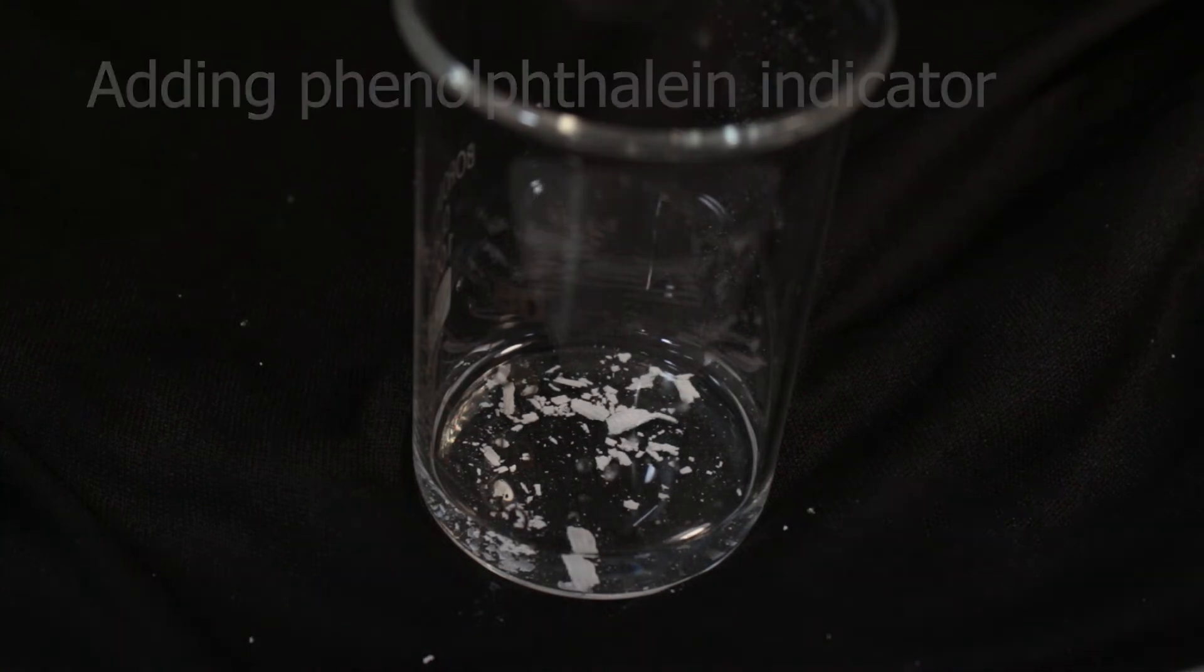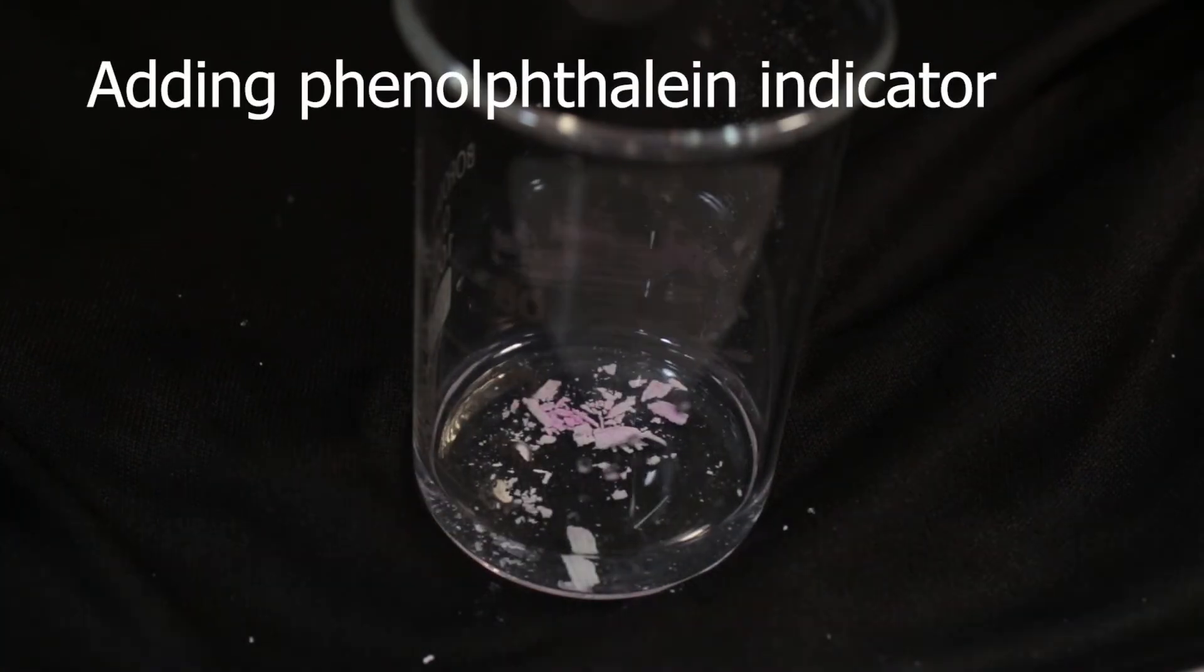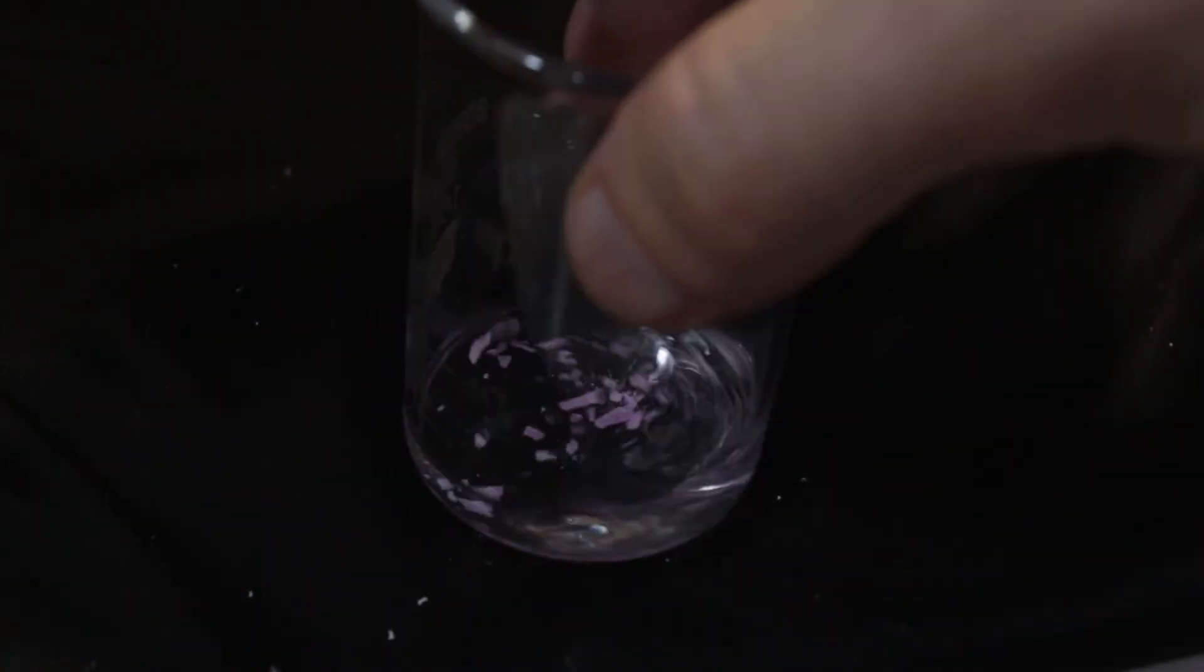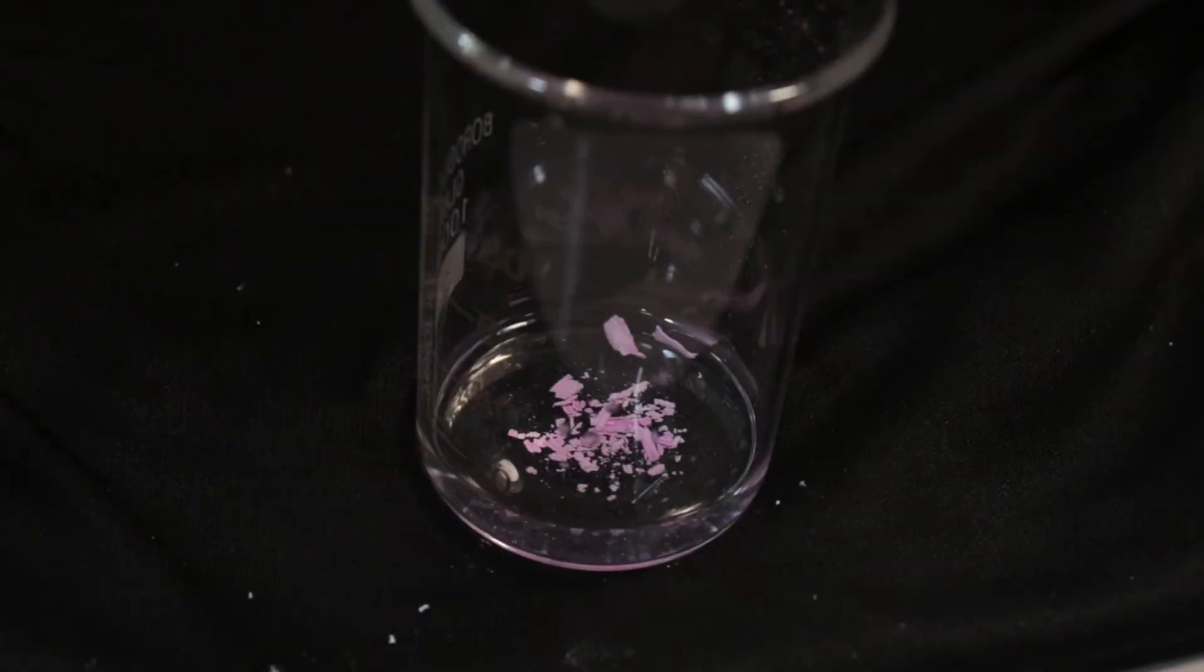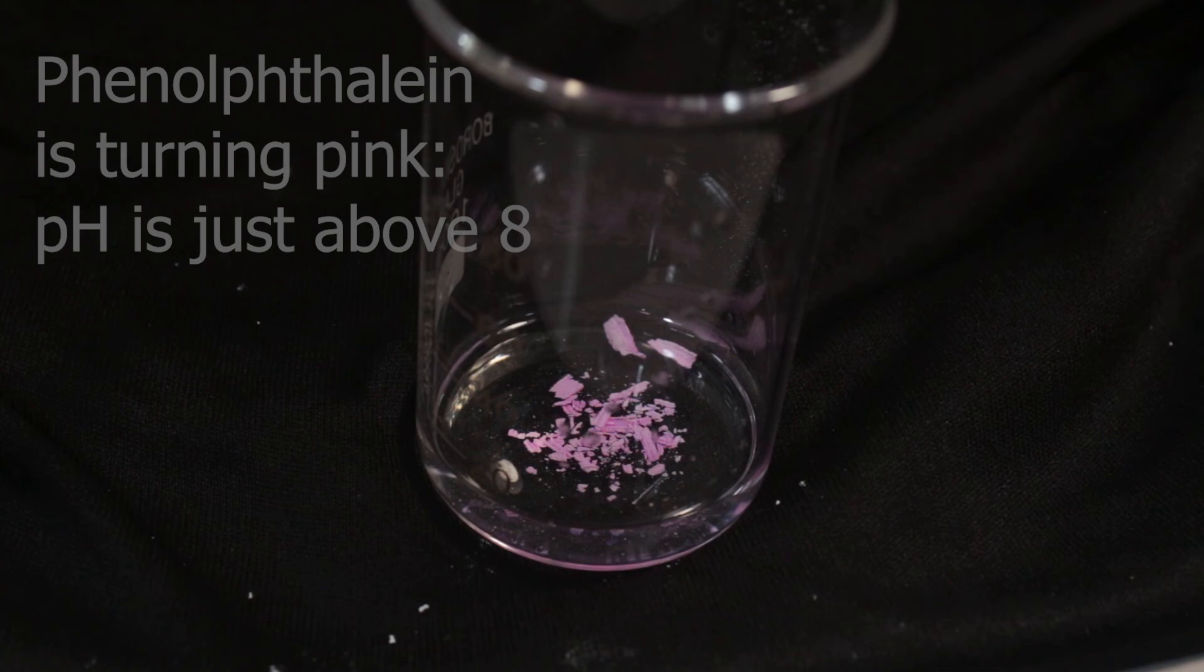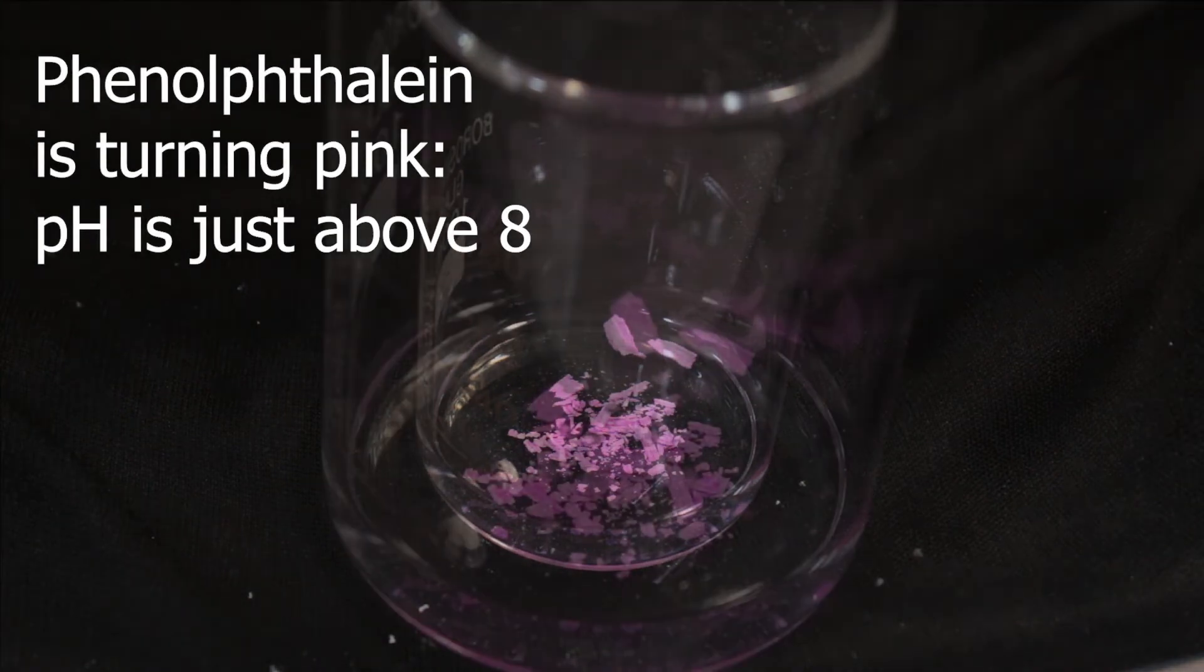Magnesium hydroxide is not very soluble in water, but if we add phenolphthalein, we can see color change on the surface of the white pieces. It means pH is just above 8.